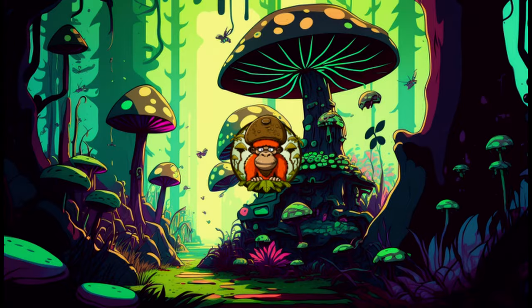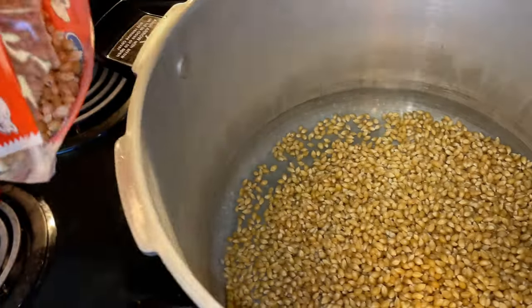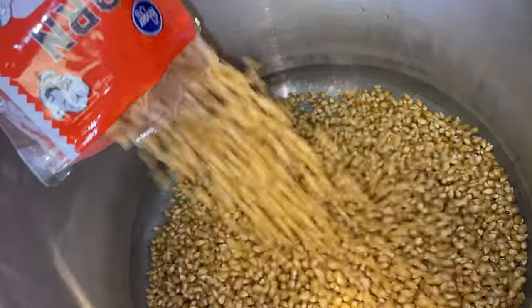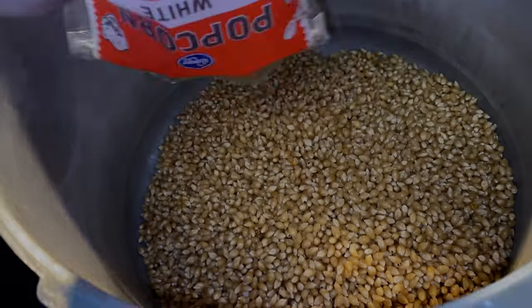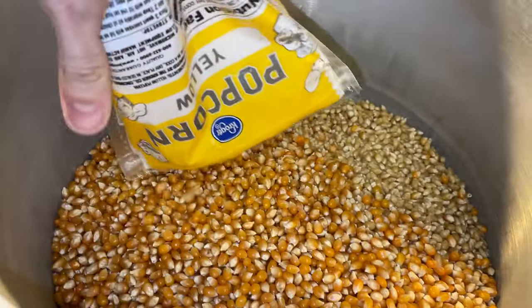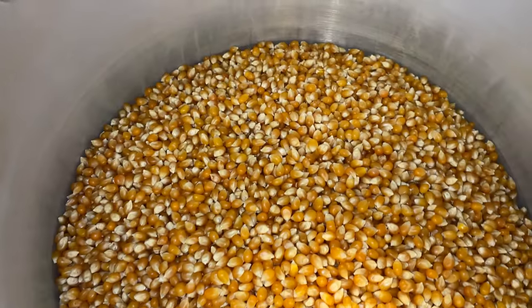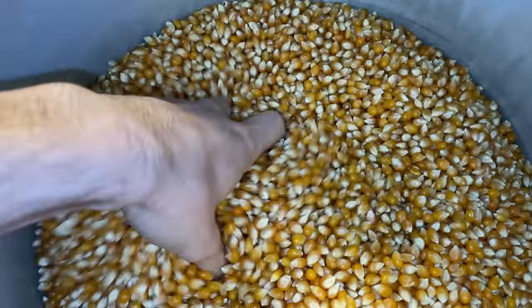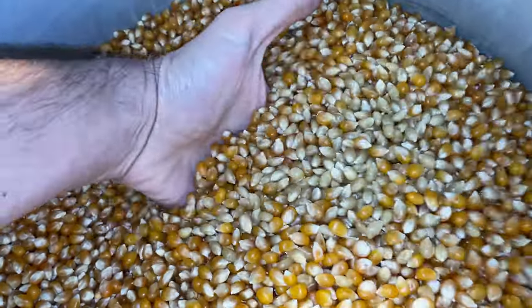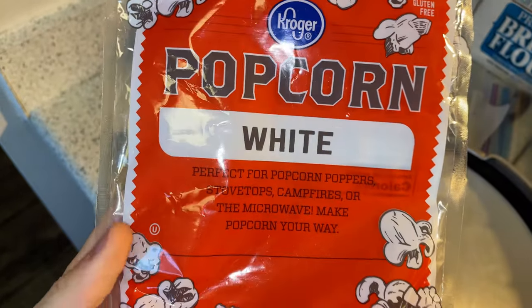Anyways, today we'll be going over how to prep popcorn for grain spawn. This is starting to slowly become one of my favorite grains to use, as this is a lot easier to nail than it seems, as well as easier to do the break and shakes — this makes it easier on my arms after I have to do a break and shake on about 12 more jars. I've also noticed that colonization times are roughly the same as brown rice, but just maybe a tiny bit lower.